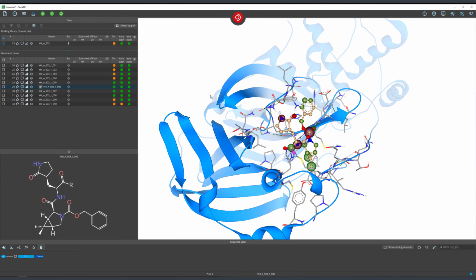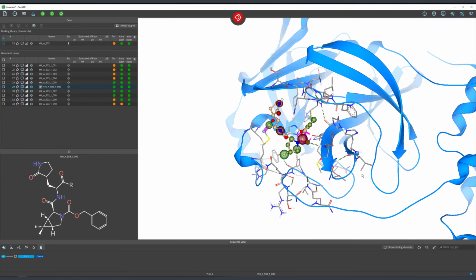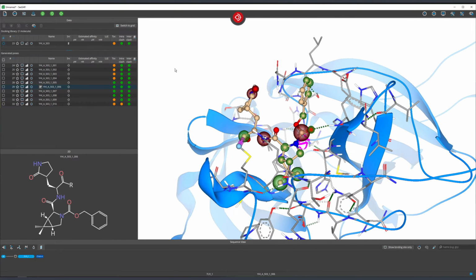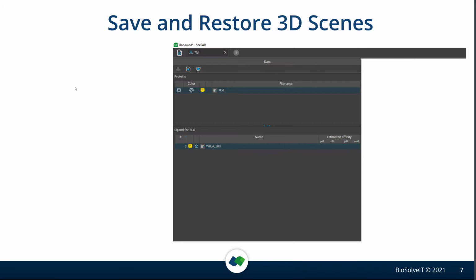So we've seen two sides of the same coin. We've seen how to prepare ligand molecules compatible for covalent docking. We've seen how to prepare your protein, especially the residues around the protein's binding site, compatible for covalent docking, and how to interactively switch between different such created residues to perform covalent docking for interactive, visual, and intuitive inspection and prioritization of your molecules using SeeSAR. And with that, we come to the end of the walkthrough of the covalent docking part in SeeSAR Hephaestus.